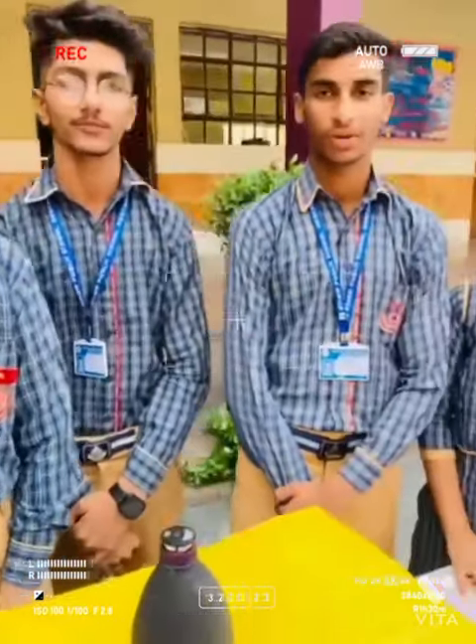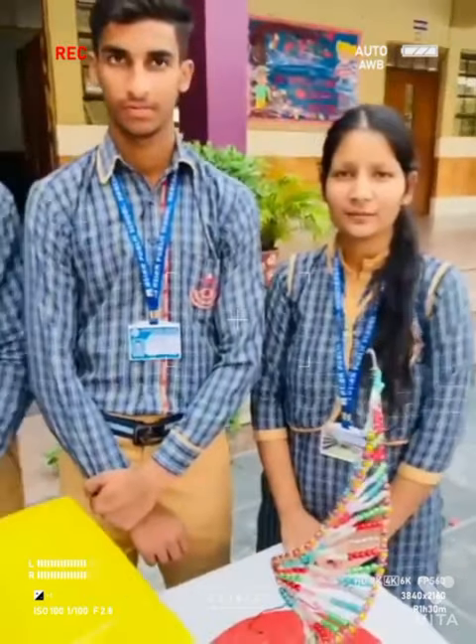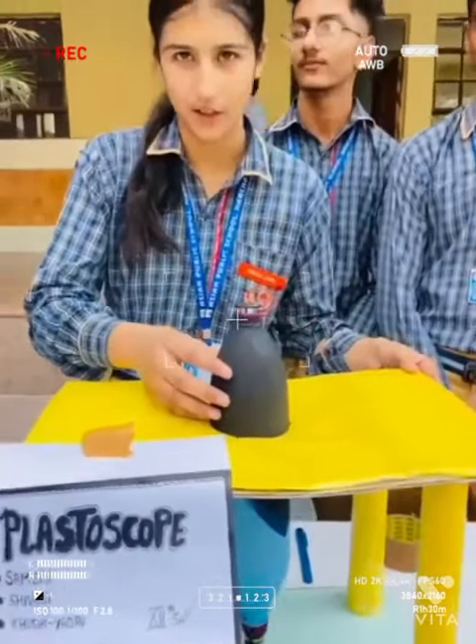Good morning. My name is Shivani, my name is Sameer, my name is Nakuragav. My name is Shivani Adhanav. We are from Class 12 Science and we have made this Plastoscope, which is a microscope made out of plastic bottles.